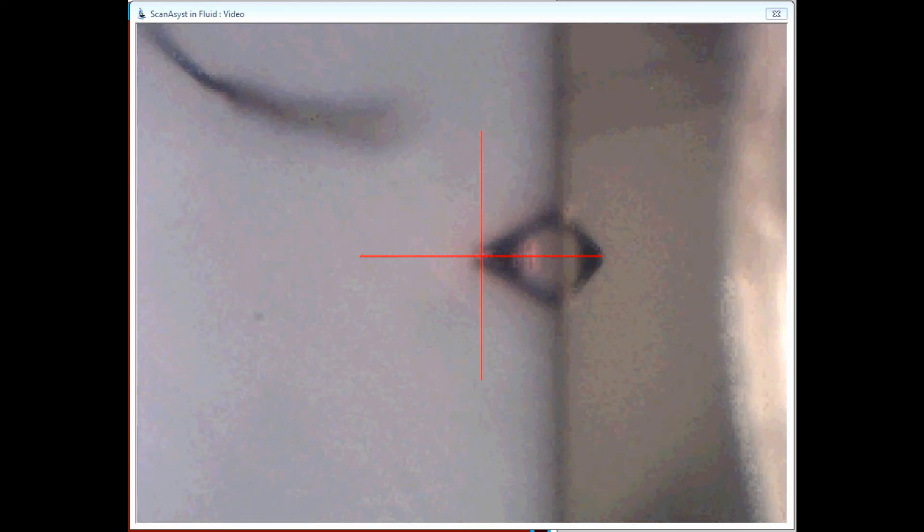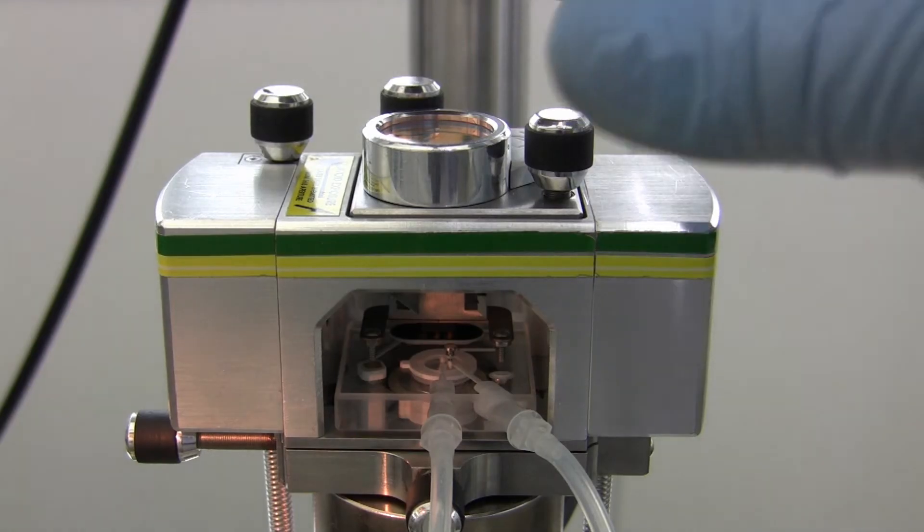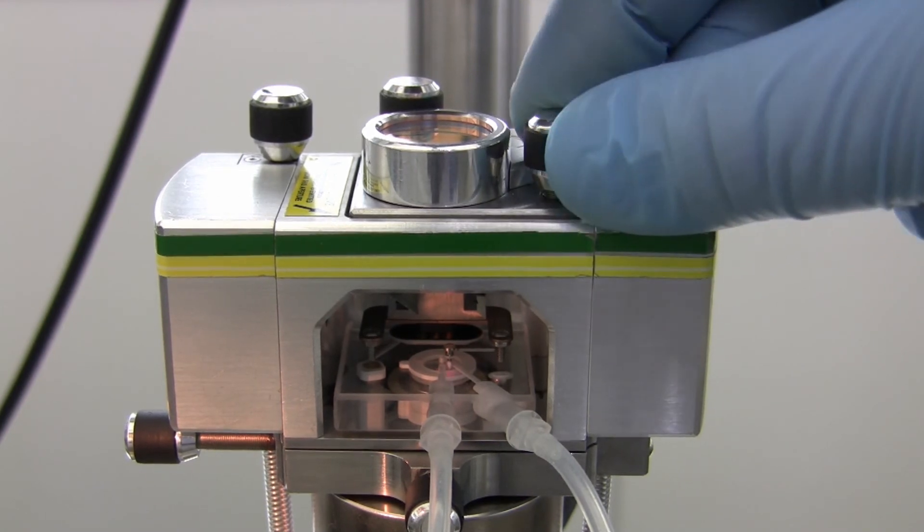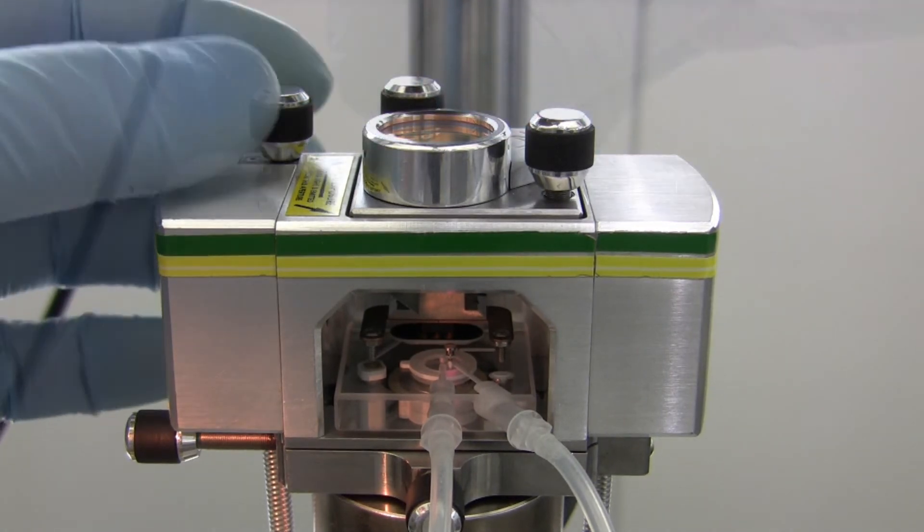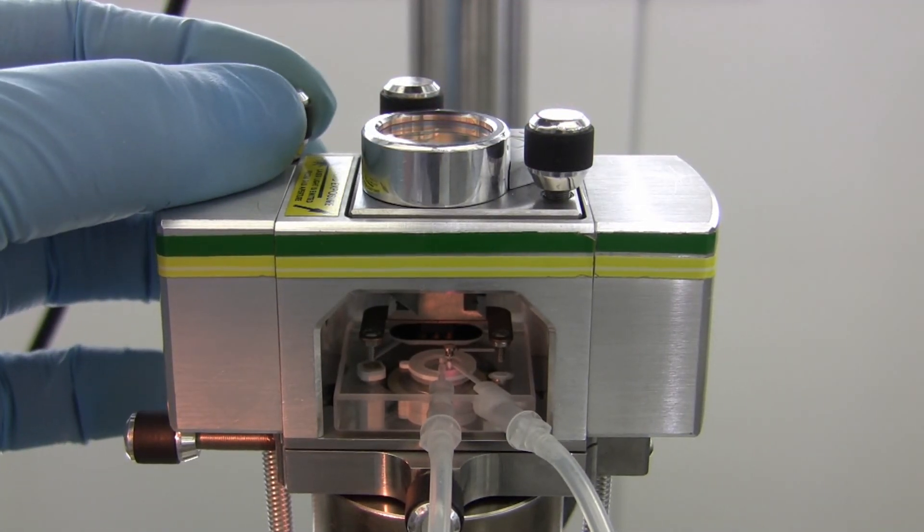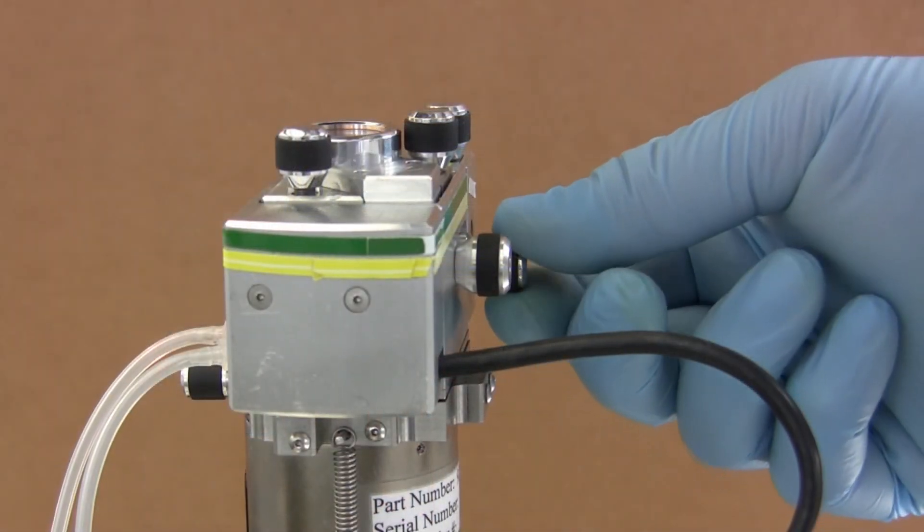The liquid environment will alter the focal point of the probe. Refocus the probe image using the camera optics focus knobs. Reposition the laser onto the probe with the adjustment knobs. Re-align the horizontal and vertical signal using the detector position knobs.